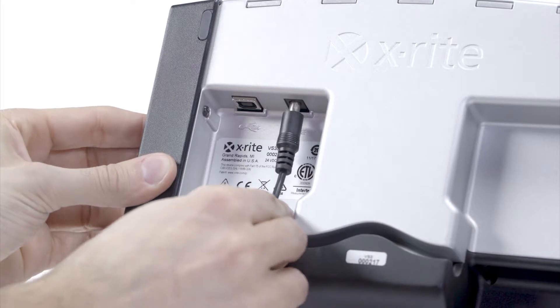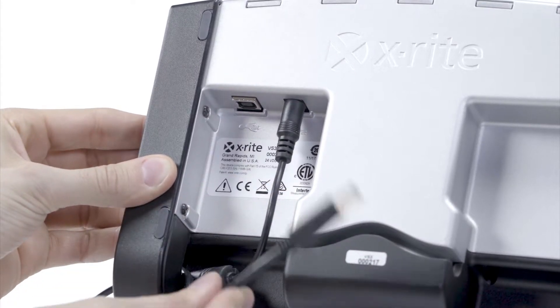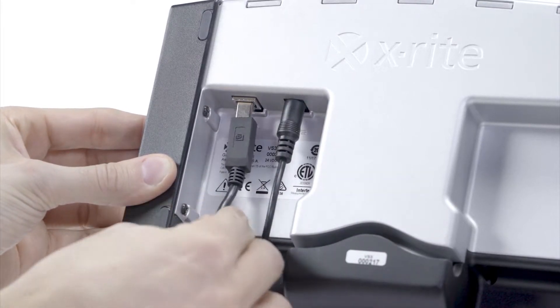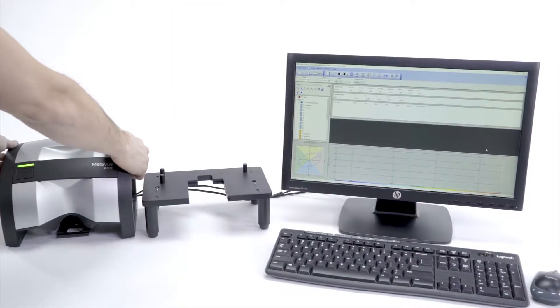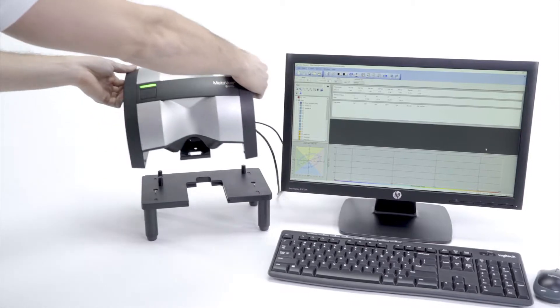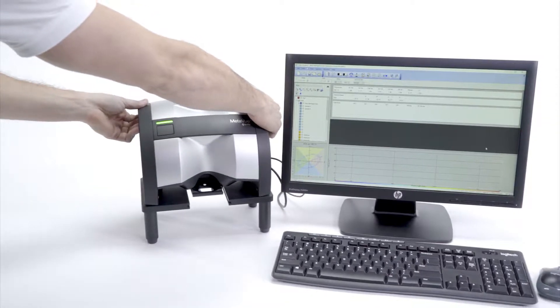To set up MetaView with the instrument stand, begin by directing the USB wires through the cable routing system. This will help keep your measurement space clear and easy to navigate. Then place the instrument onto the stand, with an option to tighten the two thumb screws that secure the MetaView to the stand.